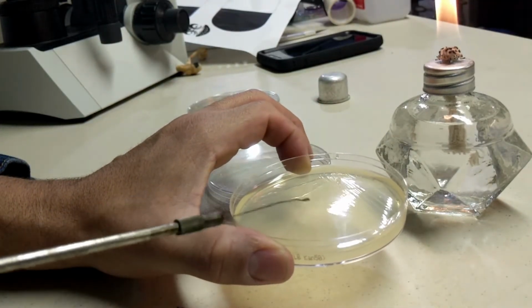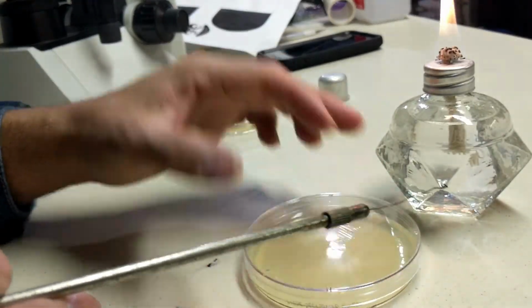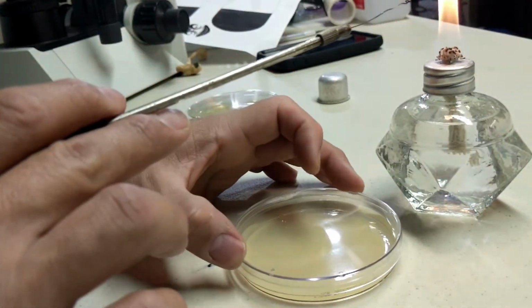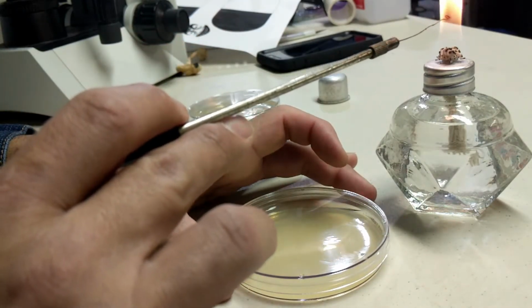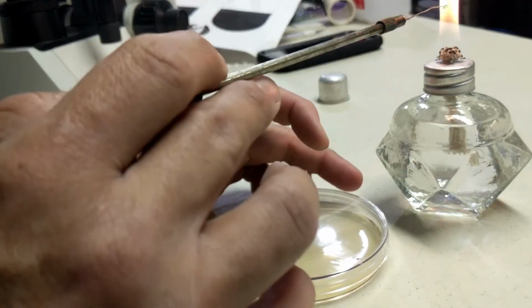So now you need to make sure that you know what you're doing in this case, because you can see the marks that are in there. So this is the quadrant in there. Normally we finish this quadrant, we close it, then we sterilize. At that point, you move your plate only 90 degrees. Why? Because now you're doing the second quadrant.